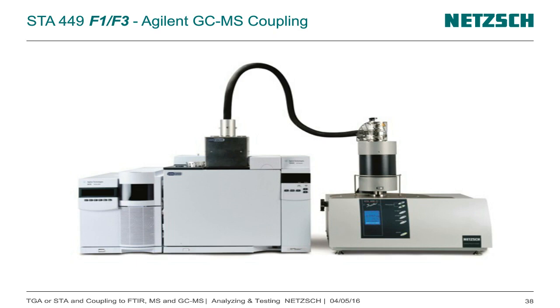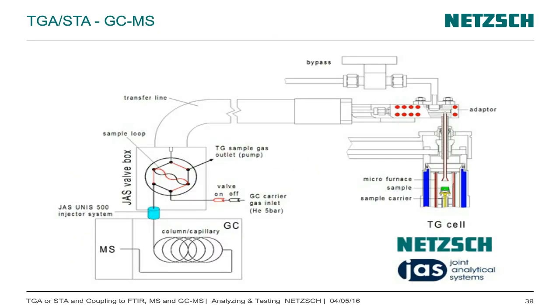But the first question is, why GCMS? So, schematic part, also transfer line, the loop, then into the furnace of the GC, and then into the MSD. It's nothing new, everybody can do it in principle. The question is sometimes how well some things are solved.